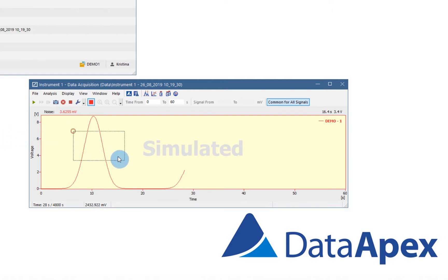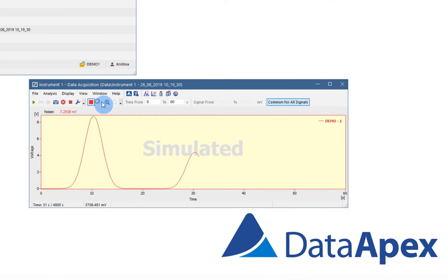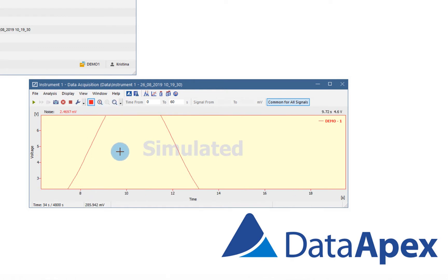You can zoom part of the graph, change to previous zoom or next zoom using the icons in the toolbar, and then double click to unzoom.